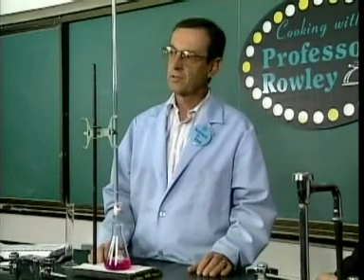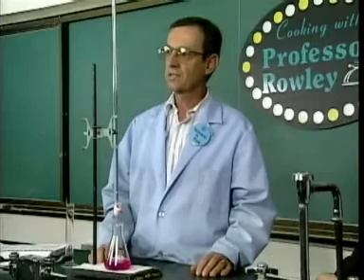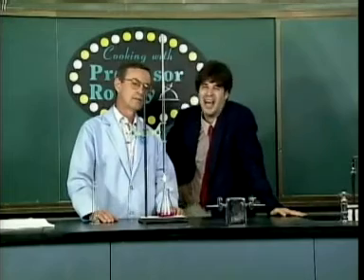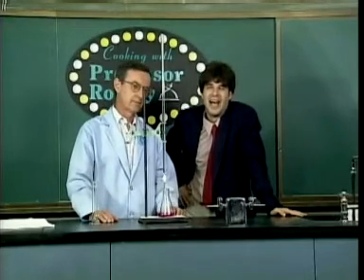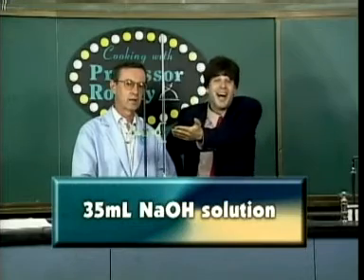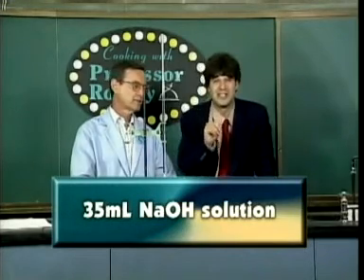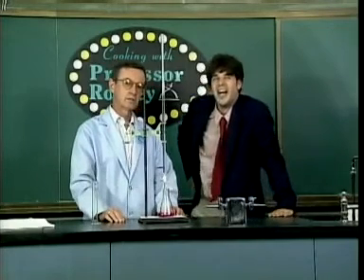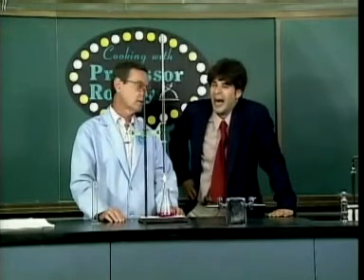The acid-base indicator has turned pink, so the reaction has reached the equivalence point. It's done. How much sodium hydroxide did you need to neutralize the hydrochloric acid? The burette tells us we used exactly 35 milliliters of sodium hydroxide. And what do you suppose the concentration is of the 35 milliliters of the sodium hydroxide solution?